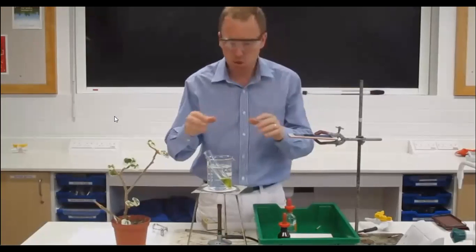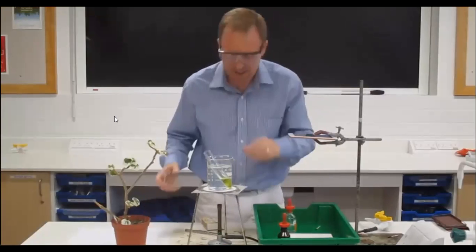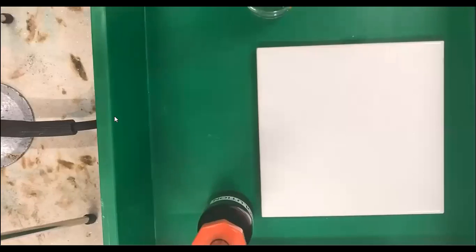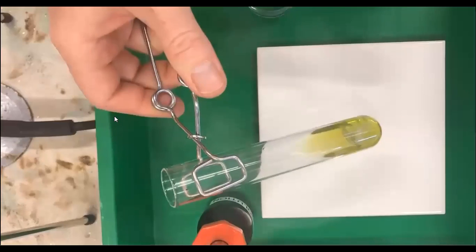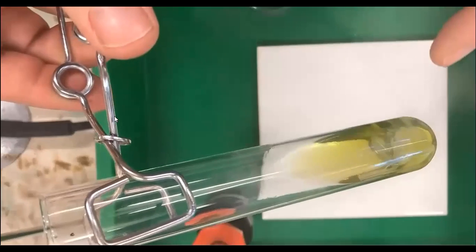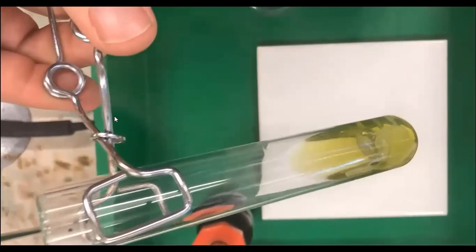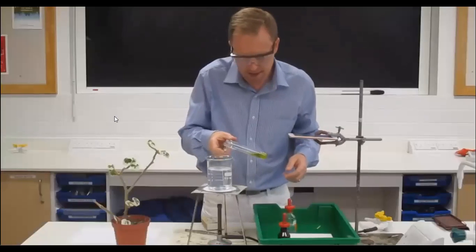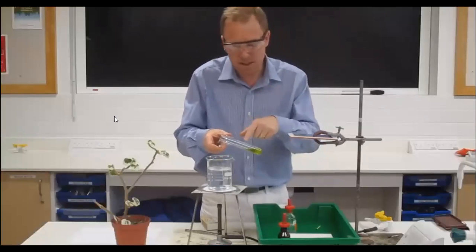We've dissolved the chlorophyll, and I'm going to hold it under the camera here so that you can see that. It's got a little bit hot in the meanwhile, so I'm going to use my tongs. And you can see there, we've dissolved the chlorophyll. It's gone off into the ethanol, and you can already see the leaf is white underneath it. Okay, we're going to pour off the ethanol. We're going to pour that actually straight back into here. And also we're going to put the leaf into there as well.